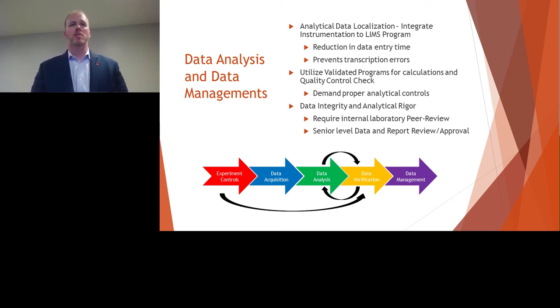You can keep it all together with each individual client, so it's easy to find and easy to work with. It can also be per different types of tests or instrumentation. There are a lot of different ways that you can organize, and you just have to organize it the best way for you and for what your lab is trying to do.